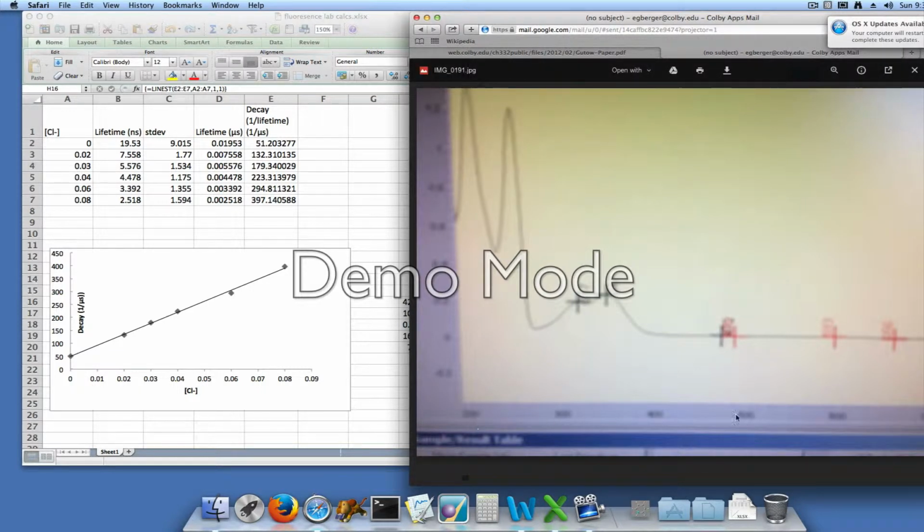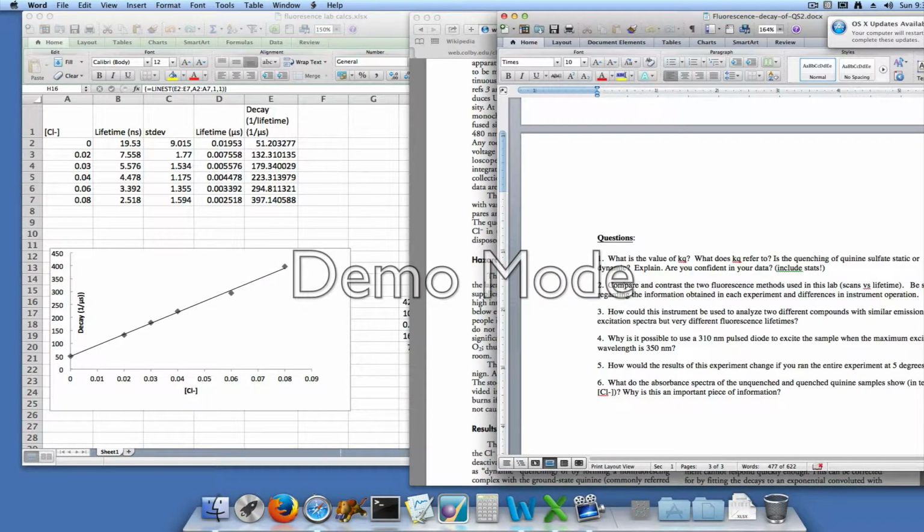So we have nanometers wavelength on the x-axis and intensities on the y-axis. And as you can see, it's pretty qualitative. There's not much we can conclude from this. So calculating the lifetimes allows us to calculate the lifetimes on the nanosecond timescale, which is just something we would not be able to do if we were doing purely absorbance calculations.